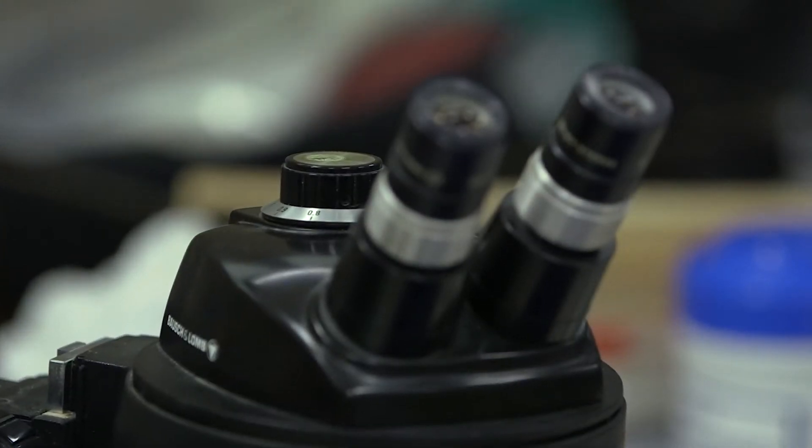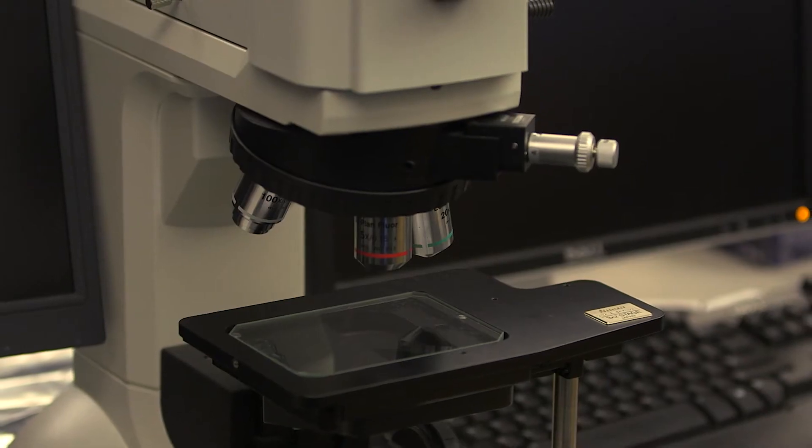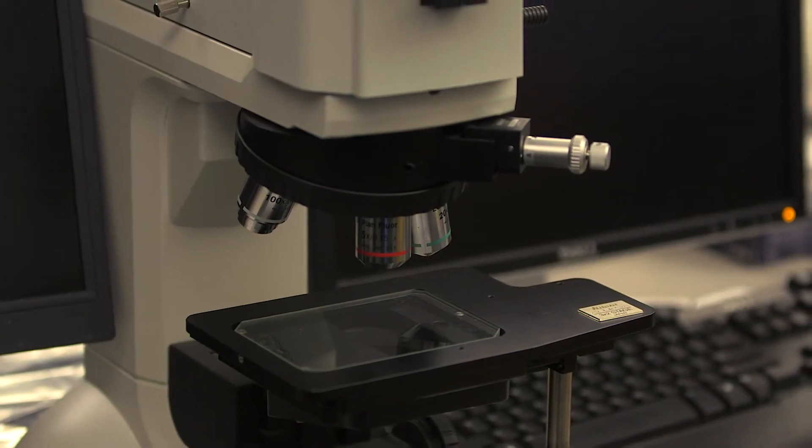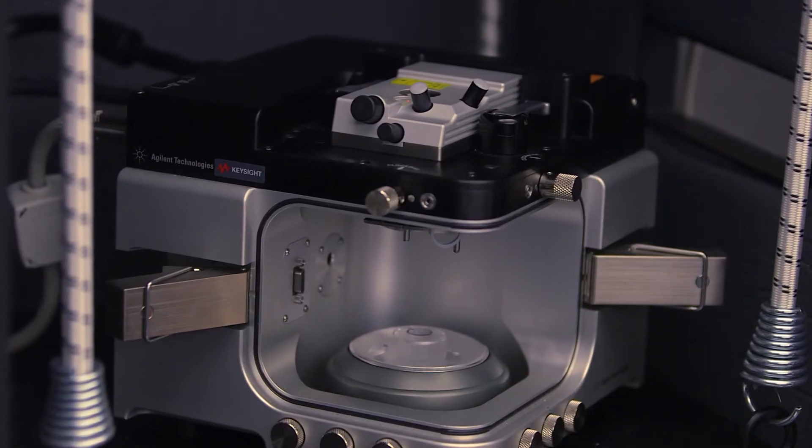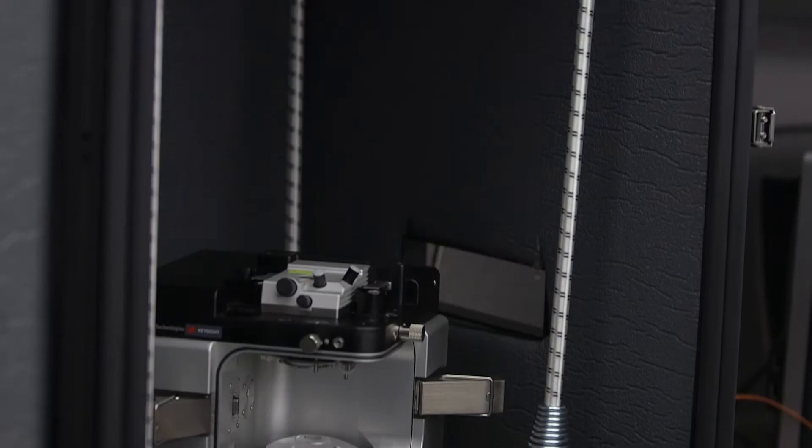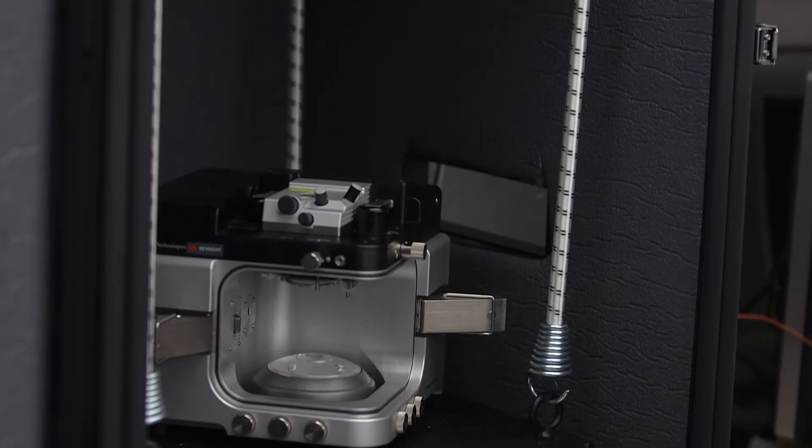Originally created for the scientific community, the application had a very steep learning curve that took years to master. Part of the problem was that the application presented all of the microscope's functionality all of the time to all of the users.